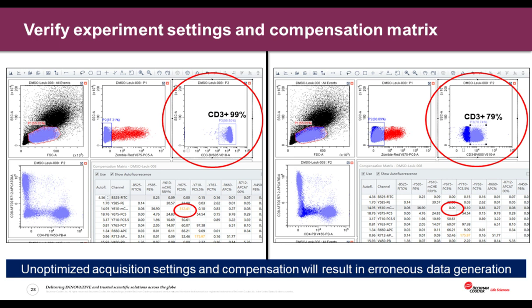Yes, I think that was the second part actually. Can you explain how you're using tSNE to bypass compensation matrices? tSNE, okay. So you cannot utilize tSNE to bypass compensation. If you bring uncompensated data into your tSNE, it will not work.